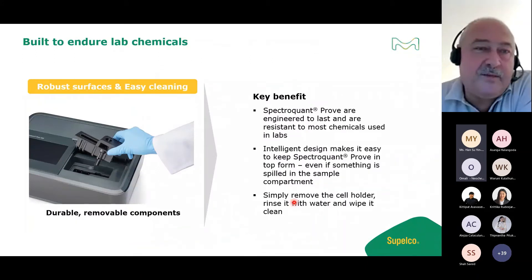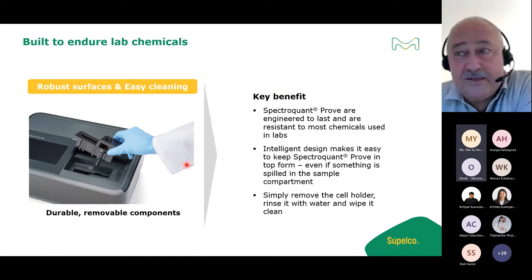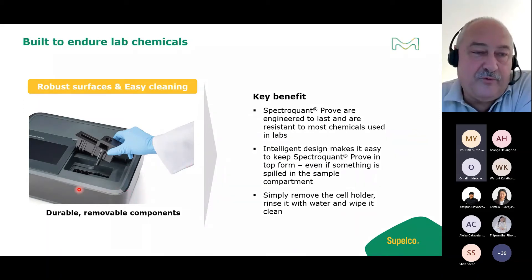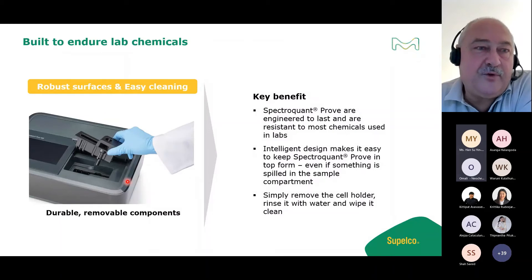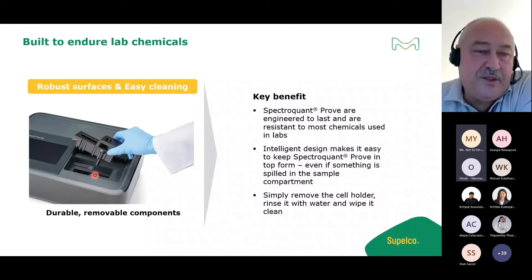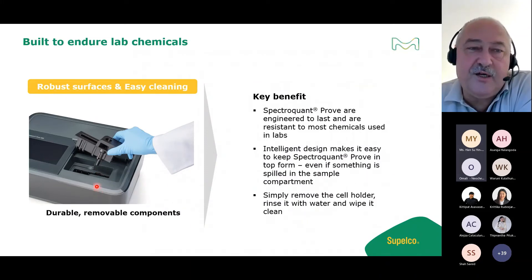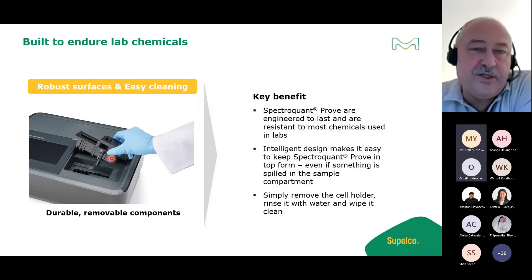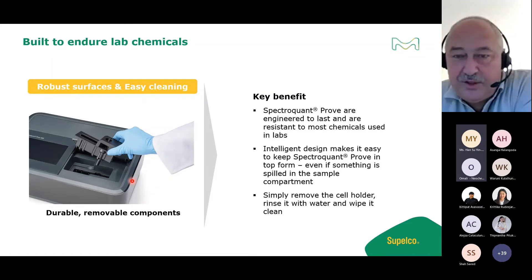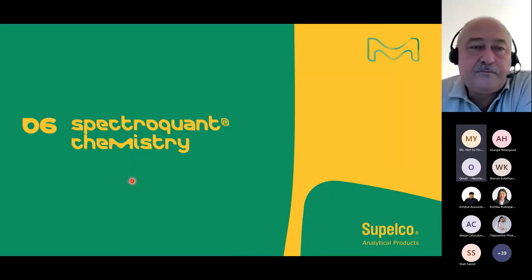Spillage is handled safely: the cell holder for round and rectangular cells is removable, and there is a drainage system built in. Any liquid spillage flows out through the drainage at the bottom and cannot contact any PCB boards due to the construction design. You simply remove the holder, clean it under water, dry it, and replace it - spillage is not a problem.